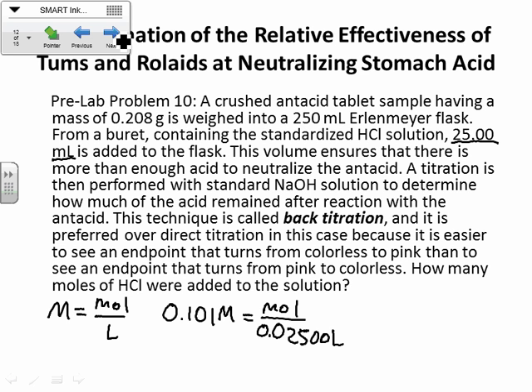So that should be, the moles of HCl should equal 0.0025. Let's see, this is a little tricky. 25. I guess technically I think that should be just 2. Let's see if this PowerPoint agrees with me. 0.00252 moles.